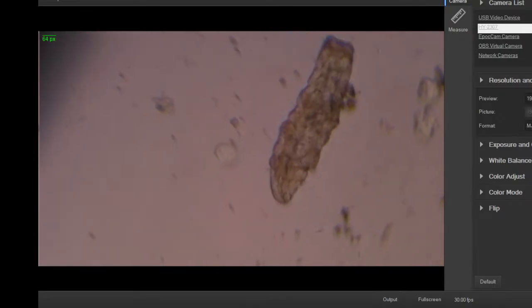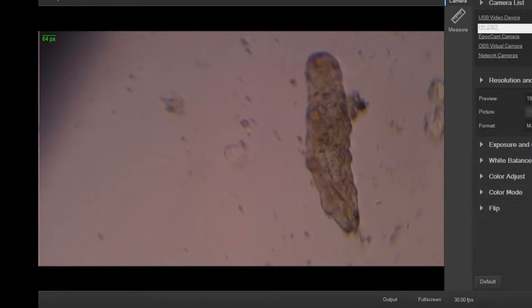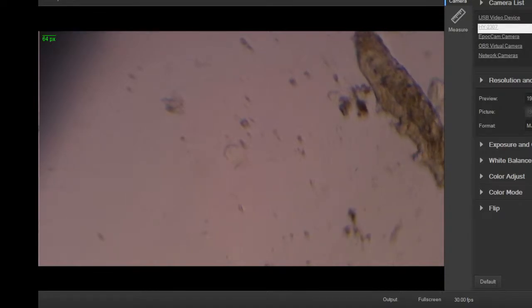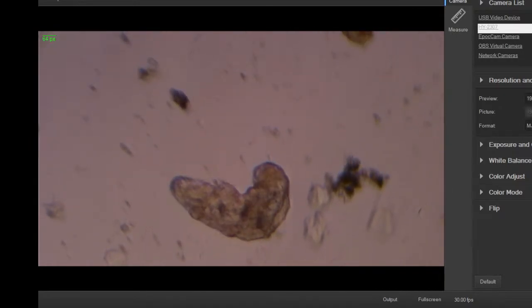He's definitely struggling because he's upside down and nothing to grip onto. So, oh, there you go. Now he's righted himself. I can try and crawl. Oh, maybe not. You can see they have 8 legs, 2 on the back section. And they're really interesting little critters.